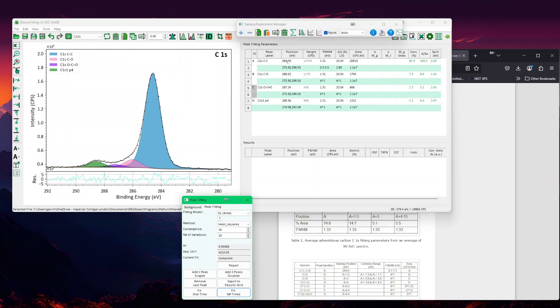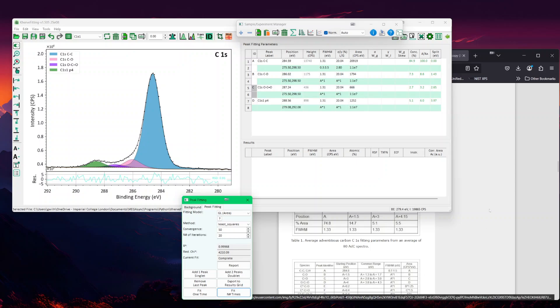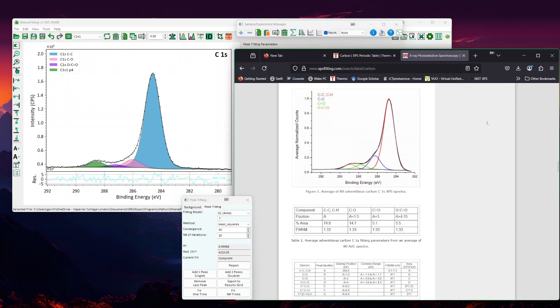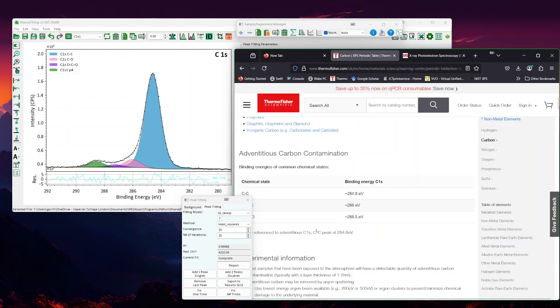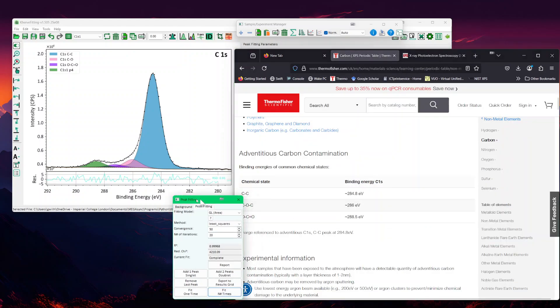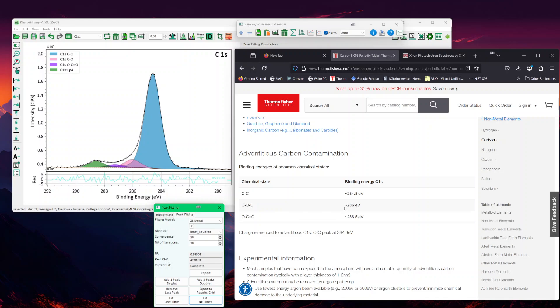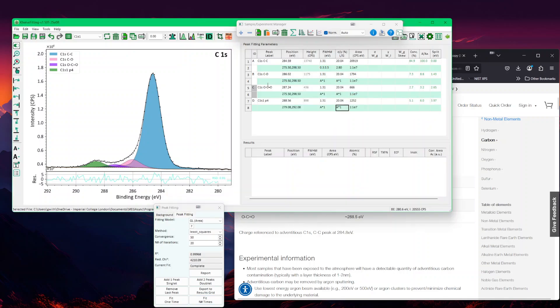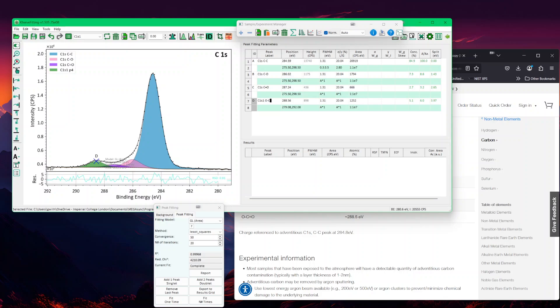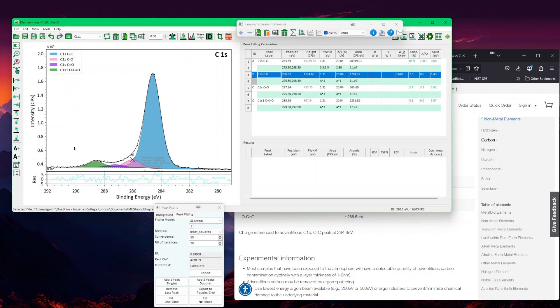Now this is more what I would expect. This is at 284.6. I would expect C-O to be close to 286. This is what you would see. C-O is usually at 286, C-C is around 284.8. Then you have O-C double bond, which vary quite a lot depending if it's C double bond, O-C double bond. I tend to give a big range for those ones. Now I will add the value. This is definitely now 287, so that's not O-C double bond because it's more electronegative than C double bond. So this is the O-C double bond. This is me now done with my plot.